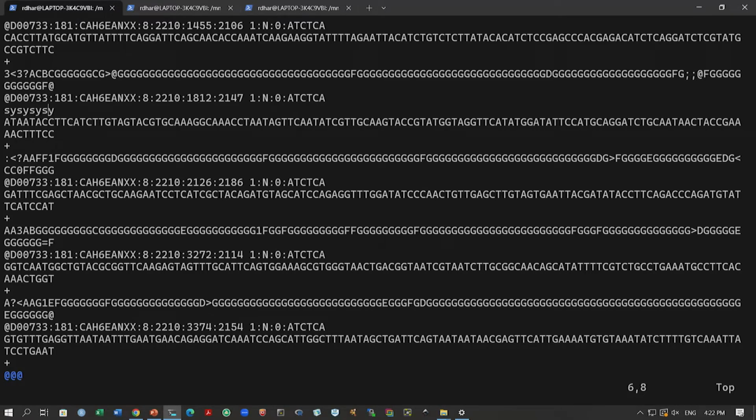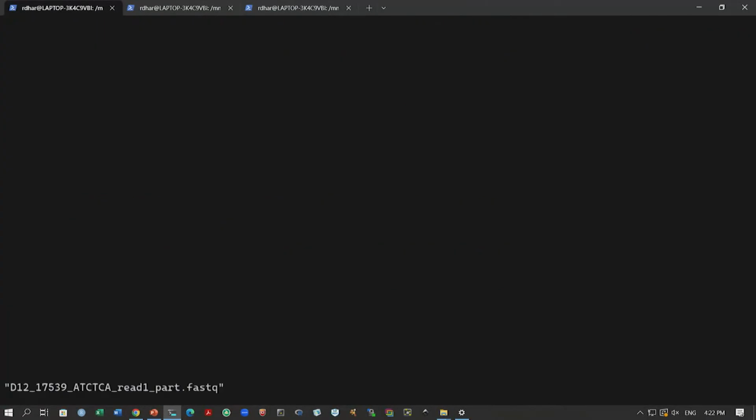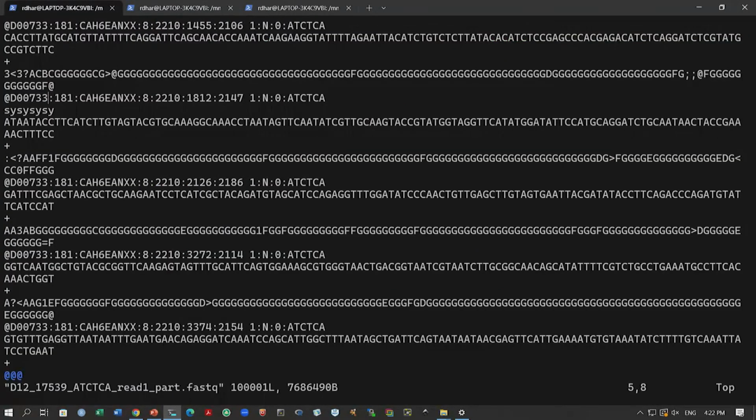The command to save and exit is :wq. And here we are out of that file. If we go back again, we will see this line is there, because we exited by saving. All right. So, these are some of the basic commands that we can use.